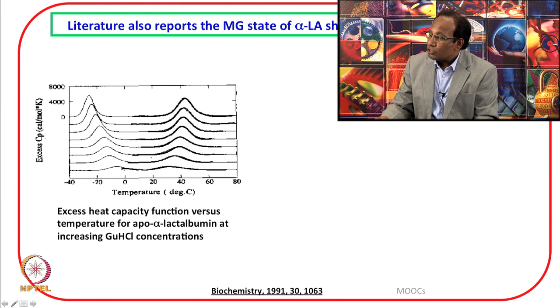When the concentration of guanidinium hydrochloride is increased in solution, please take a look at how the area under the curve decreases, and even there is a left hand side shift towards the transition temperature. This is cold denaturation. So, let us not focus on this at present, let us focus on heat denaturation.